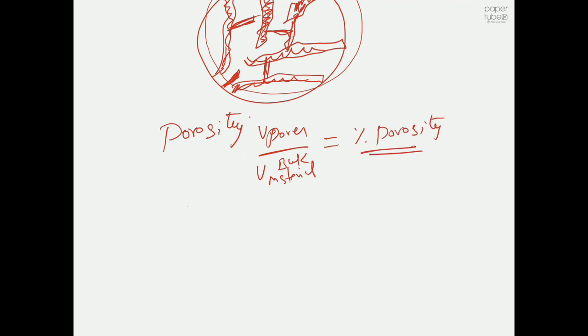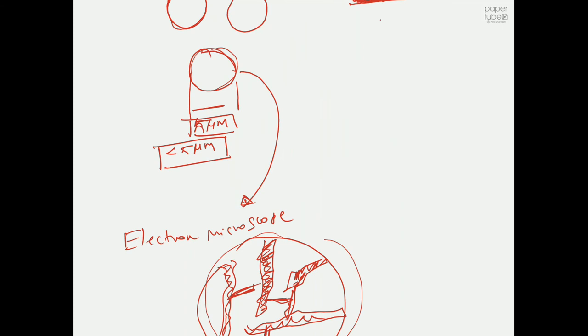Typically the materials which we use in the lab and also commonly in the industries are highly porous. So try to keep these points in your mind. Typically this porosity will range roughly from 45% to 55%. So keep these things in mind. The diameter of the particle is roughly less than or equal to 5 microns.